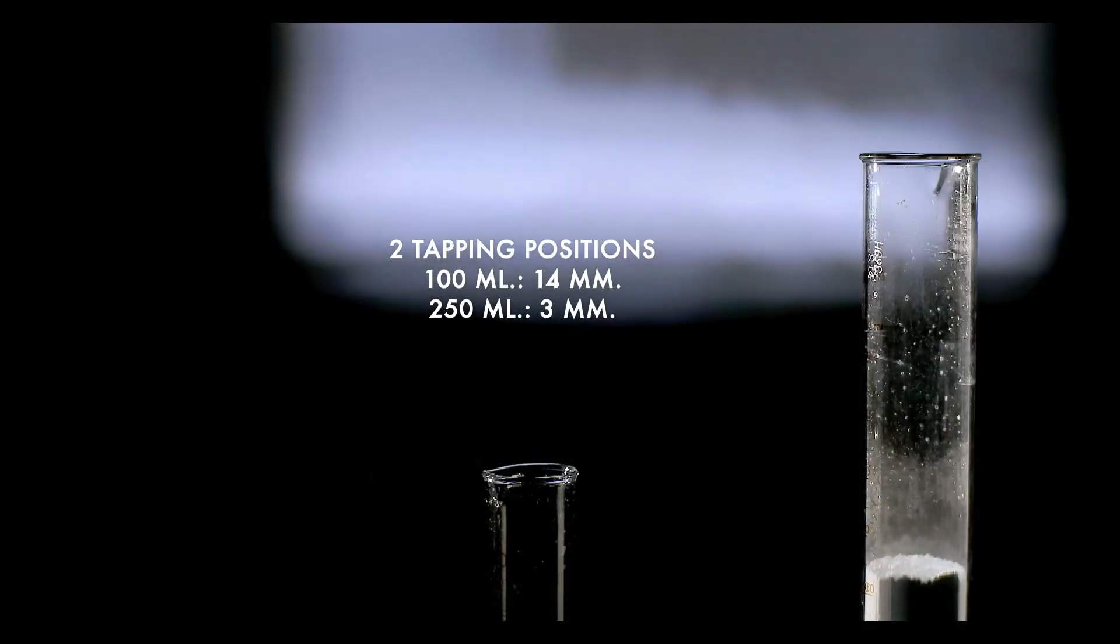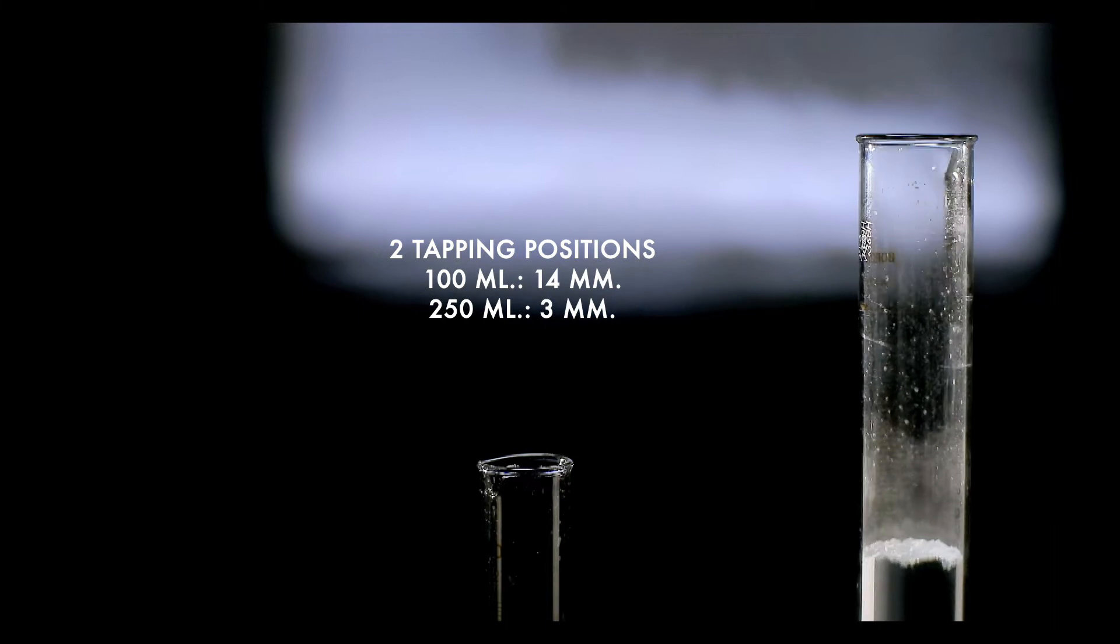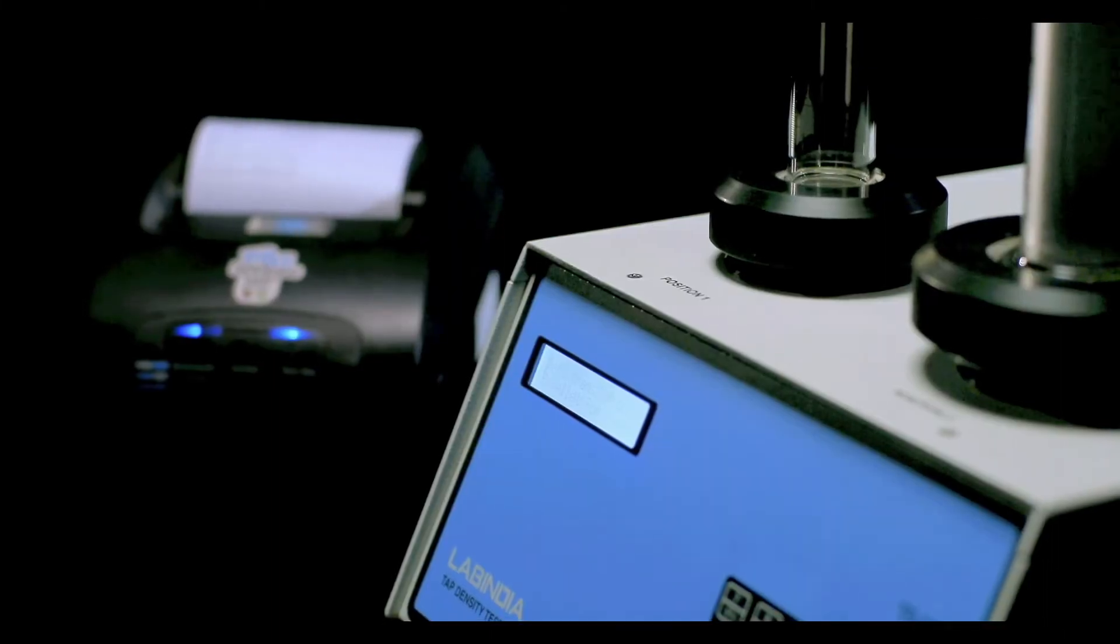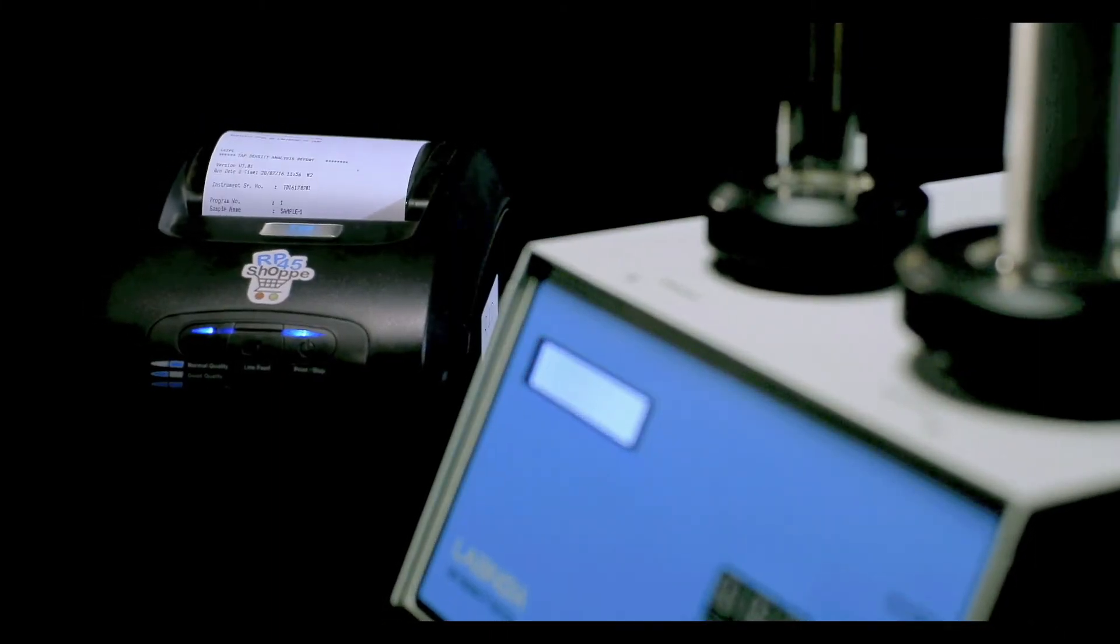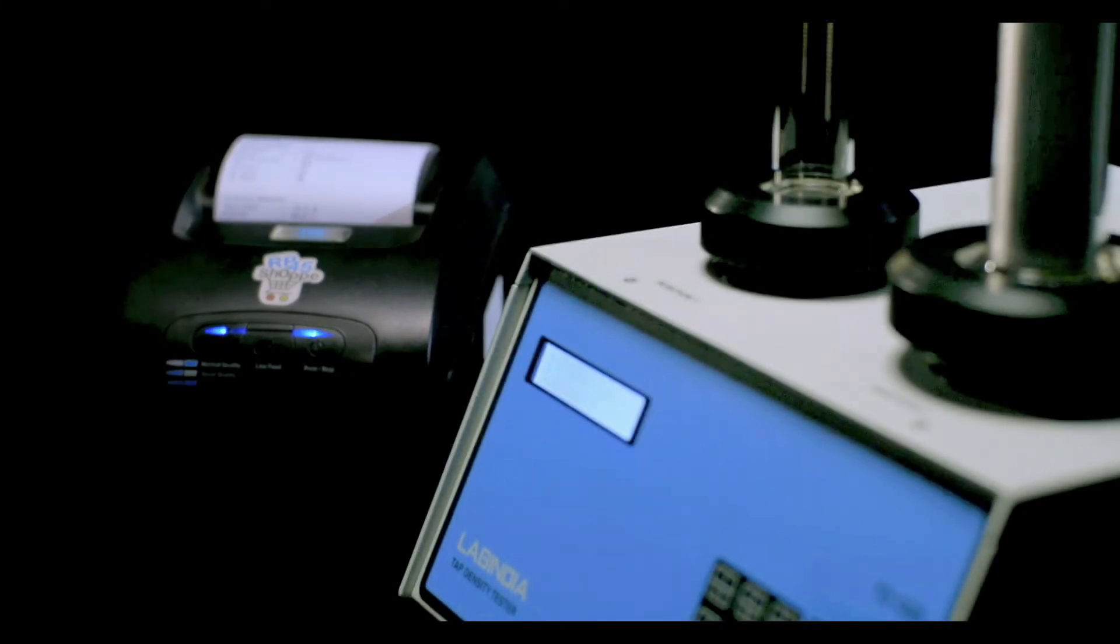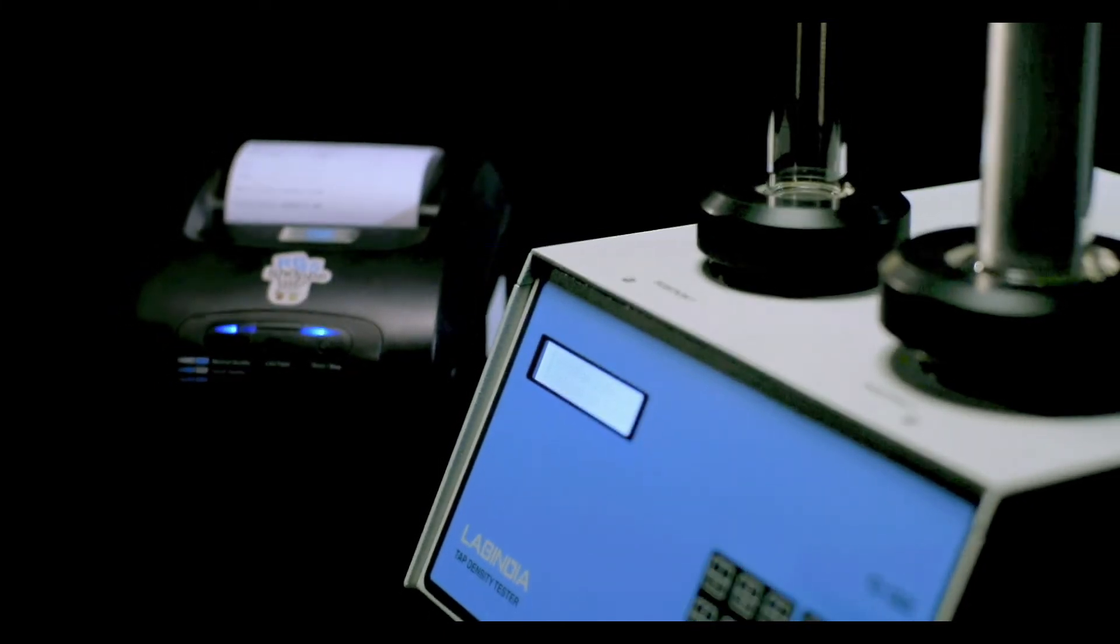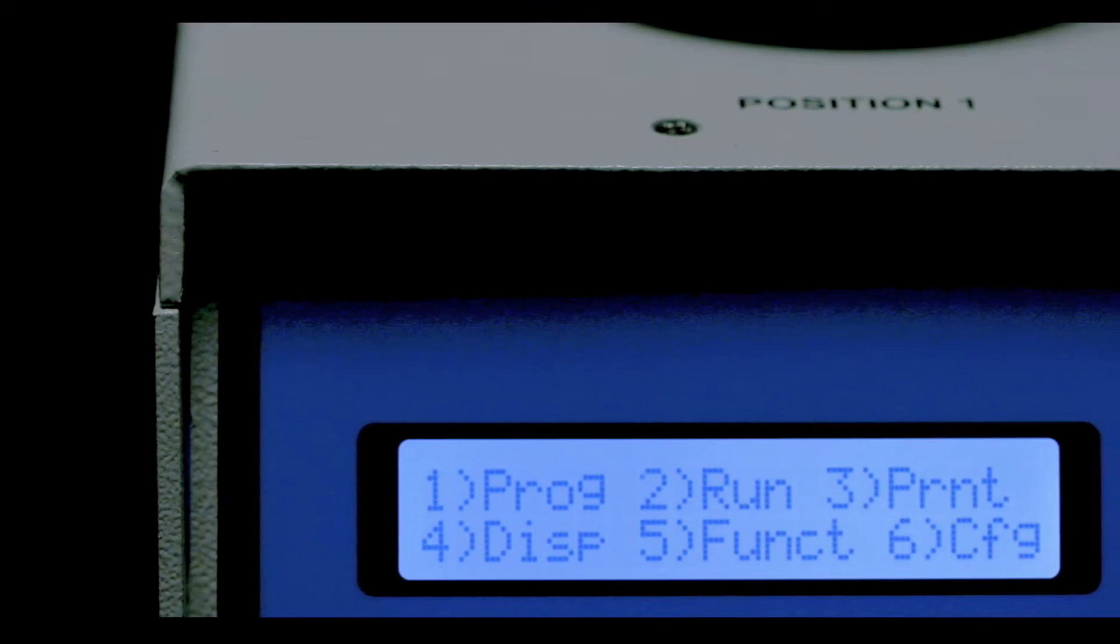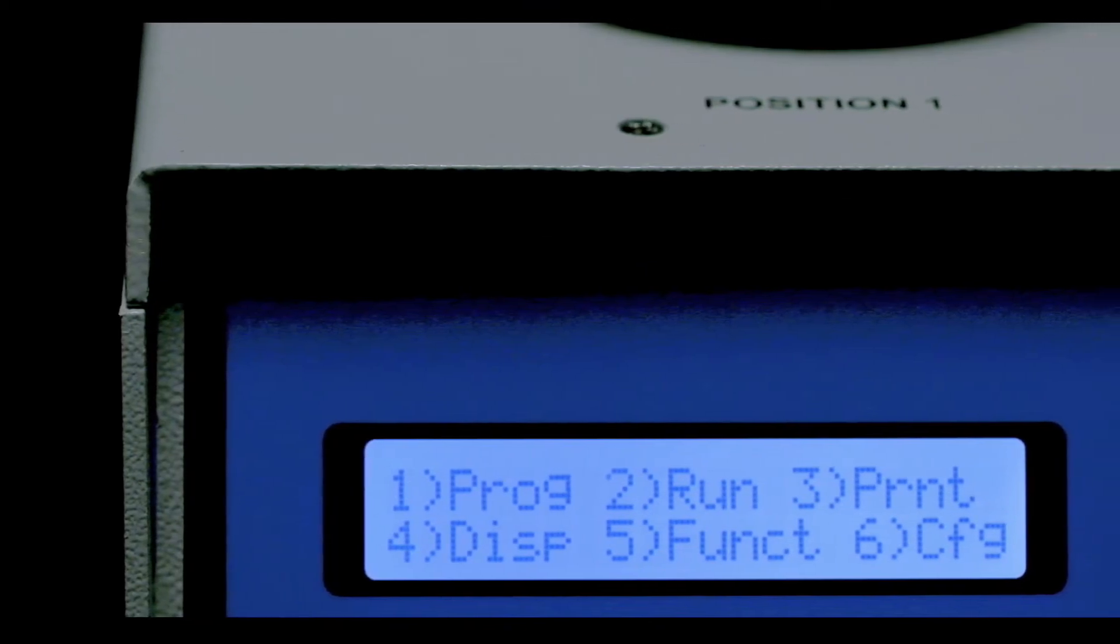validated two tapping positions as the protocol demands. The software is user-friendly in dialogue mode for ease of operation and the GLP compliant reports are comprehensive and systemized.